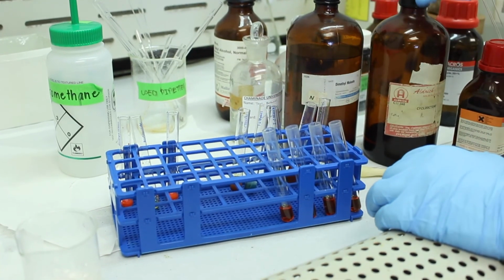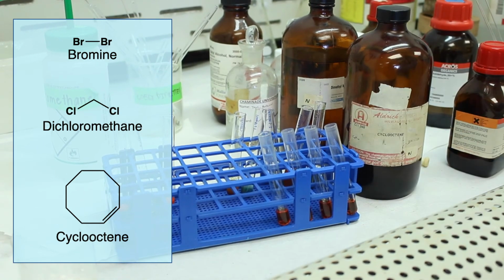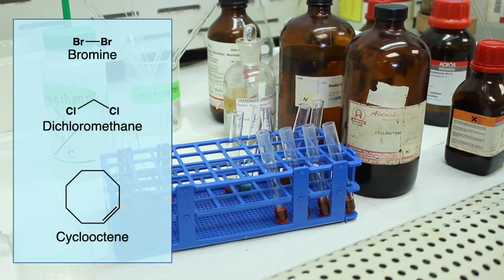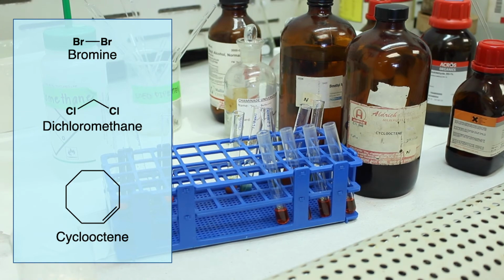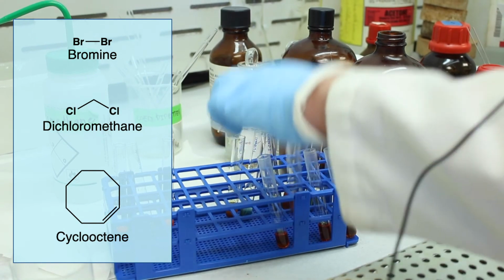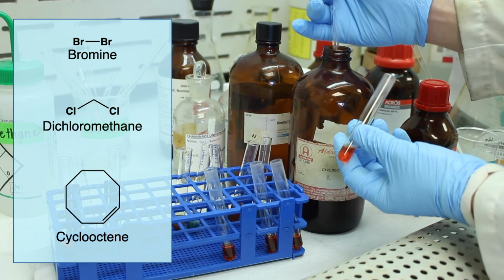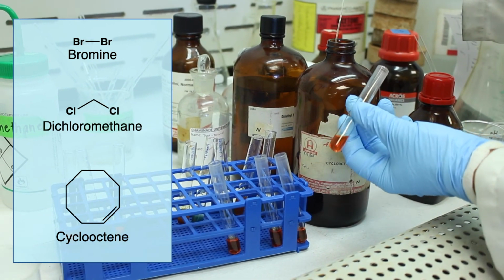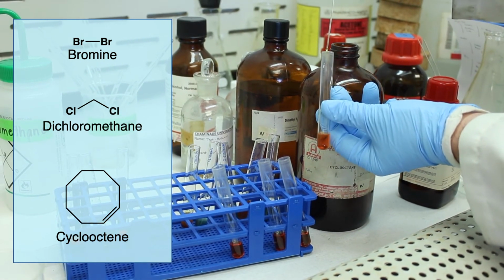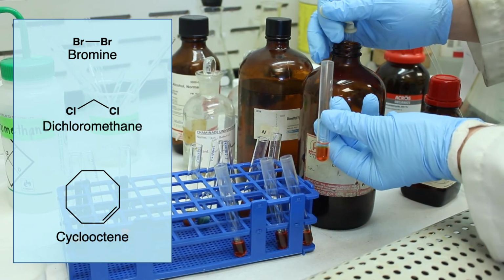The first test we're going to do is with cyclooctene. So cyclooctene is an 8-membered ring, and there's a double bond in it. That double bond is unsaturated, and it will react with bromine. So if we add a little bit, we expect the color to disappear. Cyclooctene is very smelly, so good thing we're doing this in a fume hood. It's not very pleasant to smell. Okay, so got some in there. When we add it, you should see the red color start to disappear. Maybe I'll add a little bit more.